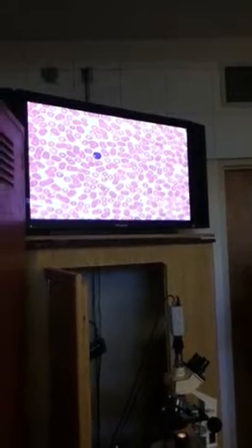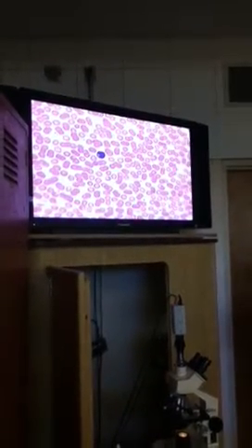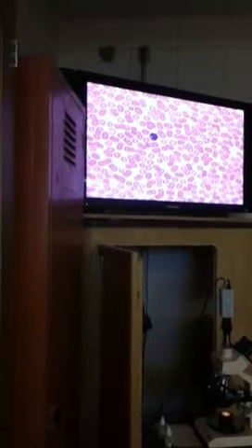Now what you probably may want to learn also, not just for lab but also for lecture, is if you look under here, each one of these has a kind of a specific attribute or characteristic. One may be very good as a macrophage or phagocytic, the other one may be good at releasing histamine or heparin, the other one may be good for fighting parasites or viruses. So make sure you learn not only to identify the leukocytes, but in case they ask you one function of each of them, you may want to do that as well. These are a bunch of platelets all through here.